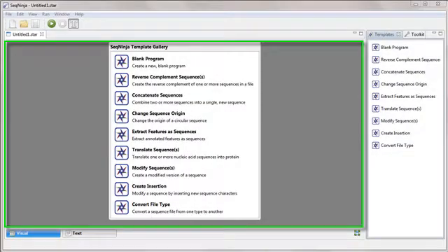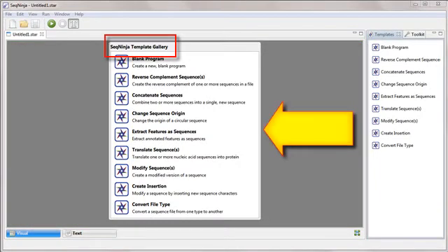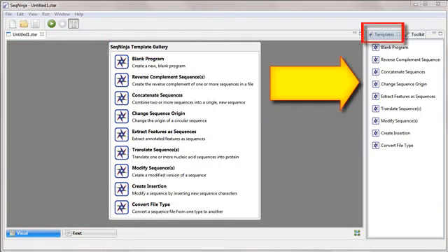The visual view on the left initially displays the SeqNinja template gallery, a list of shortcuts to items in the templates panel.